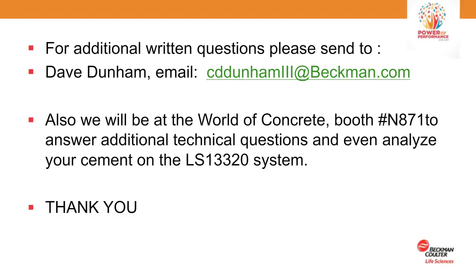But it's quite automatic, and as I mentioned during the lecture, the universal liquid module has a built-in pump, so it's drawing fluid from a source. This can be a 5-gallon container, or a gallon bottle sitting next to the instrument or underneath the instrument. If it's a 5-gallon container, it can draw it up from the floor. So it has a very good diaphragm type pump to pull clean fluid up for rinsing purposes. And then it's going to go into a drain container. Since this is a solvent, you don't want to dump it down the drain. And that drain container also has level sensors, so when it gets full, it will stop the ability to keep adding fluid to it, so you don't have any overflow. And it's time to drain your rinse container or the waste container. That comes with the instrument, the module.